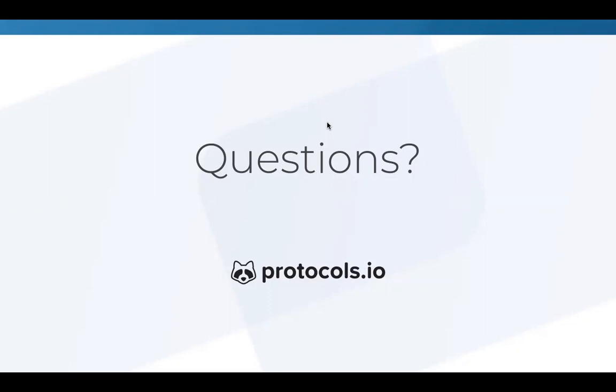Right, so we have an open API, but I'm not a technical person, so I can send you a link afterwards and you can check it out. I can also connect you to our developers if there's anything unclear, but you should be able to do all these things with the open API. All right, so basically you support the import of the data via the API.